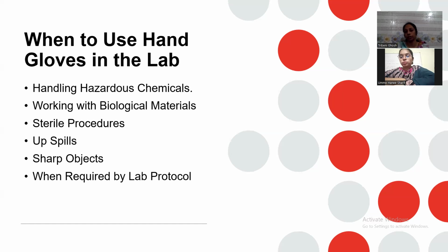And when required by lab protocols, and any other things. There are several things when you work in the laboratory, many kinds of experiments and many kinds of work. So whenever your lab protocol requires hand gloves, you must read the protocol and wear hand gloves during that time.